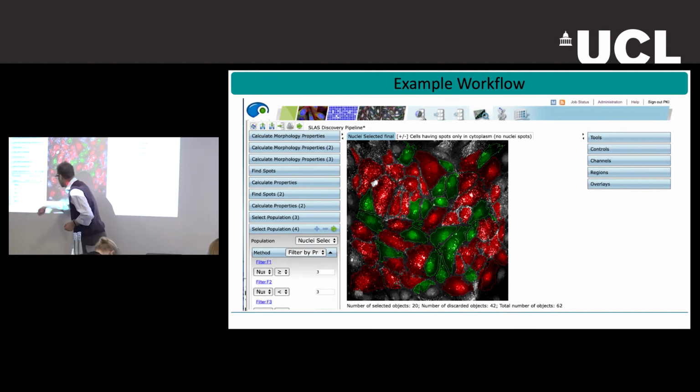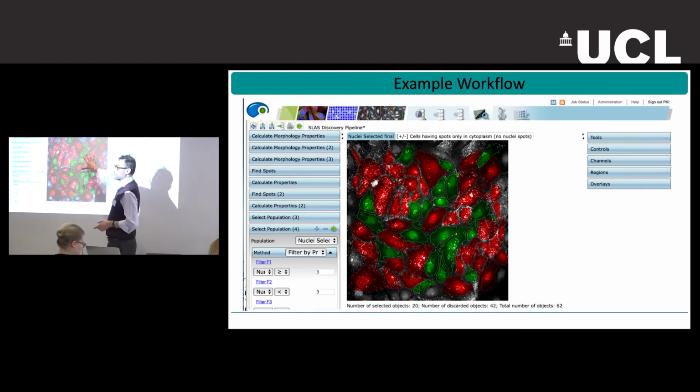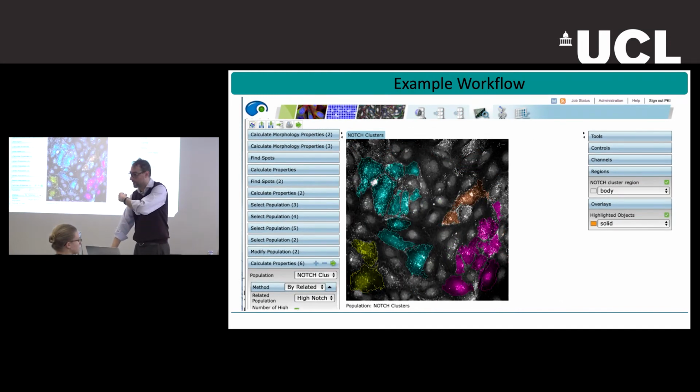All right, in the cytoplasm, I think. Well, anyway, you apply this rule, which is simple mathematics, simple logic, and you can basically classify yourself. So I think this might start answering your question about how you cluster your cells, how you define a cluster. And this is the thing we do later on in the same procedure.